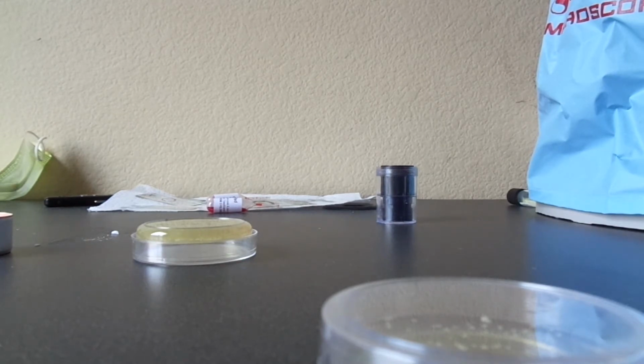Okay, so it's kind of semi-solid, but it's blocking the tip here.